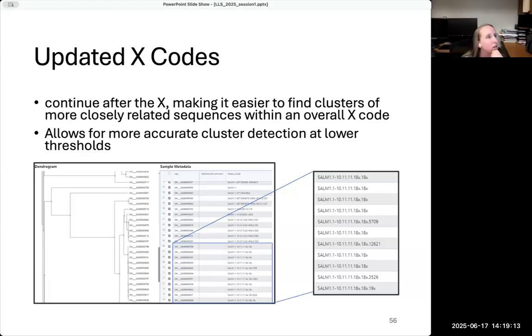Jack or anyone, I think you answered the question. Is there not a way to see the actual distances in PulseNet? You should be able to find actual allelic differences in PulseNet. I know with PulseNet 2.0, depending on what isolates you're looking at, you might have to get a little creative with some of the filters, or you can add things to comparisons if you need to use different filters to find different isolates. But yes, if you can get the right isolates, you should be able to compare them and get allelic differences.